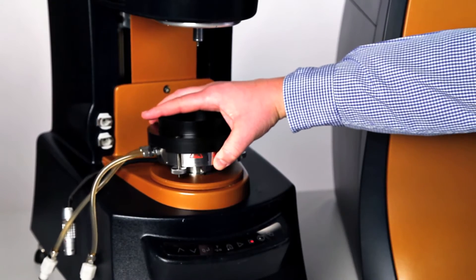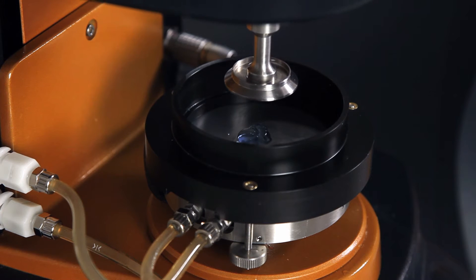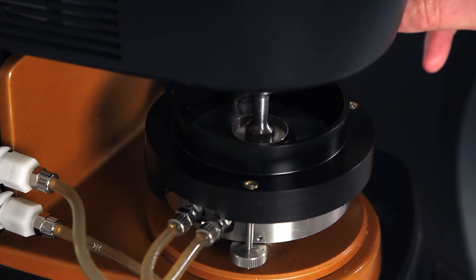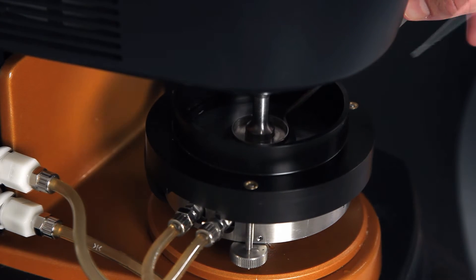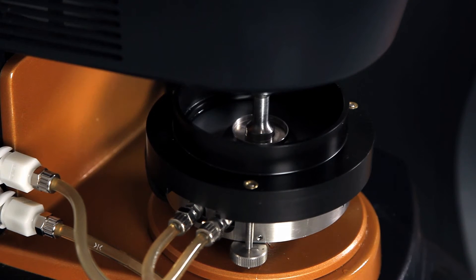Then zero the gap of the geometry, put your sample, go to the geometry gap, trim the excess of sample, and fill the immersion ring with the fluid. Now the sample is loaded.